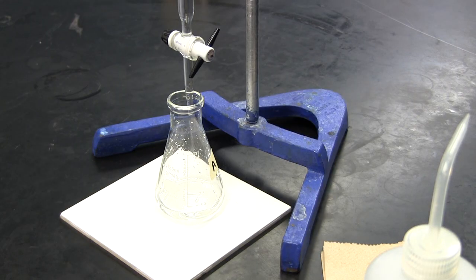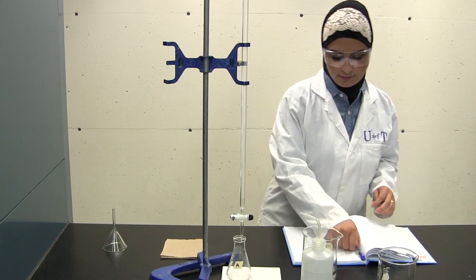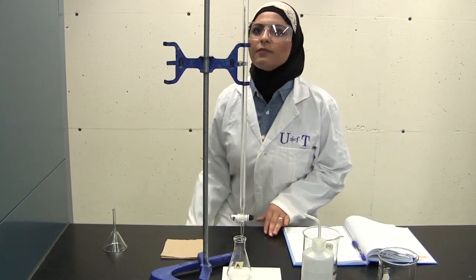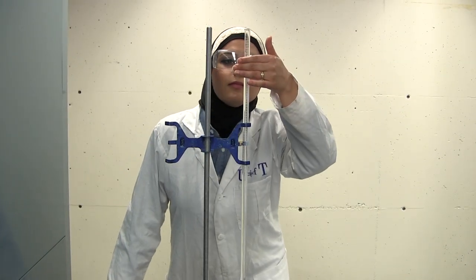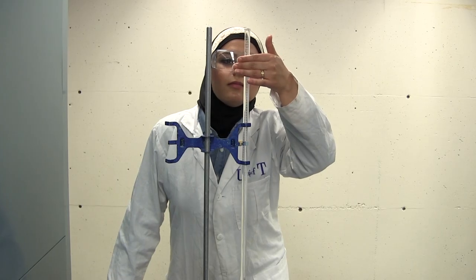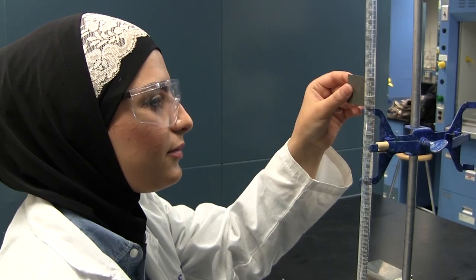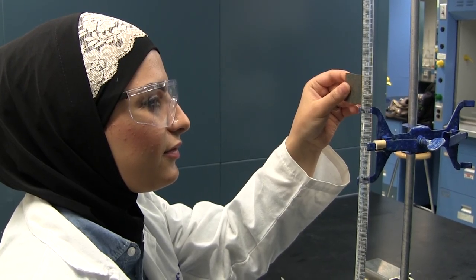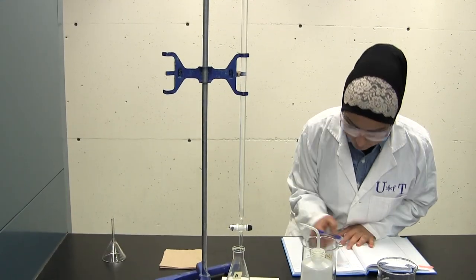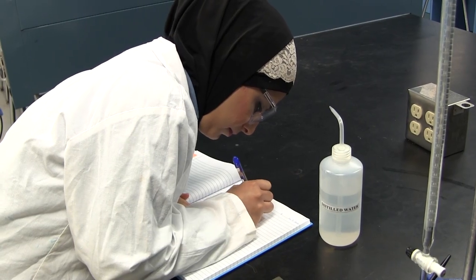Once you are set up, take the initial volume reading to the nearest 0.02ml. You will have to estimate the last digit. This digit is important and significant. Be sure your eye is at the level of the meniscus — reading from an angle rather than straight on results in parallax error. You may want to use a burette reading card to help you take a more accurate reading. Record the level of the meniscus in the burette carefully before and after every titration, and record this reading in your lab notebook.